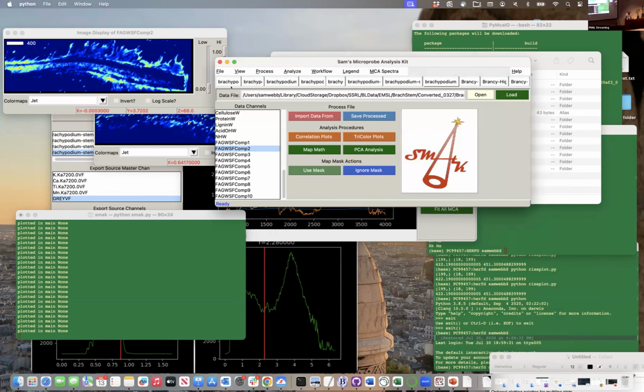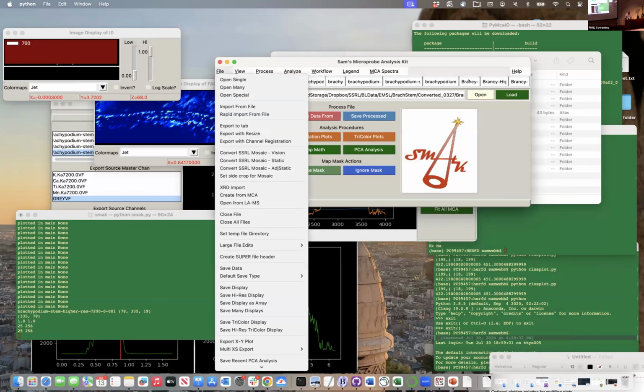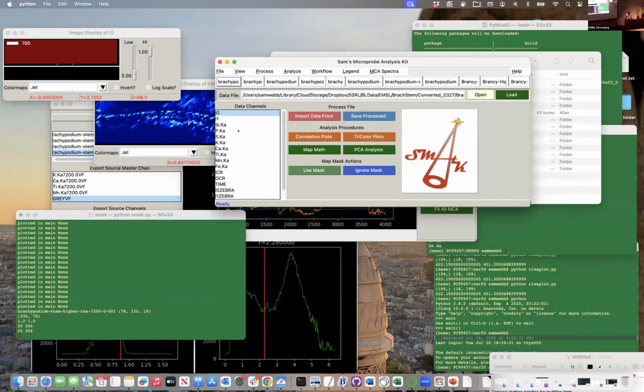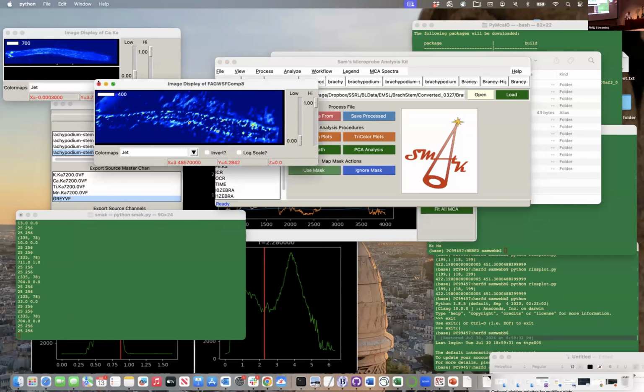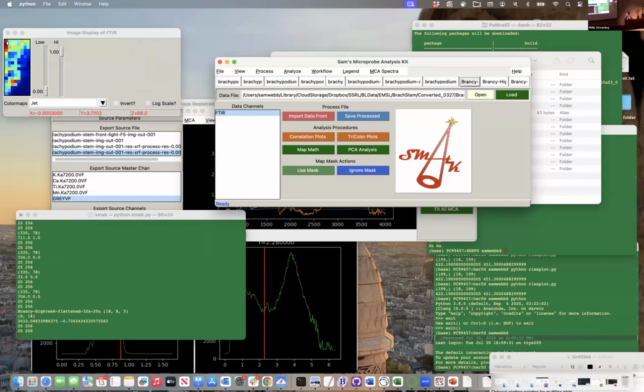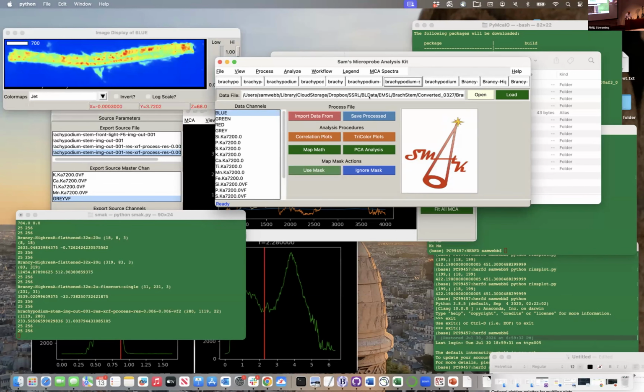this can actually be an interesting example. I'm just going to cluster some of the XRF data for ease of looking at it. So here we are with several bits. I'm going to go to the nicer one, with slightly better resolution. There we go.